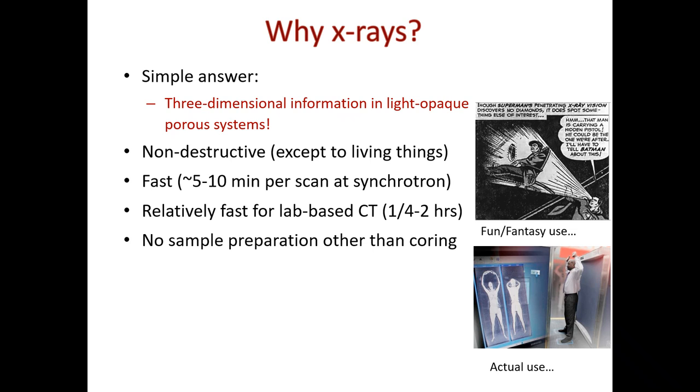1,000 times 1 micron is 1 millimeter. So if you put a 1 millimeter core in the scanner, you might be able to get a good image, except that you're most likely going to crush it even with that little bit. And again, most of the time we're going down to 1 to 5 microns.